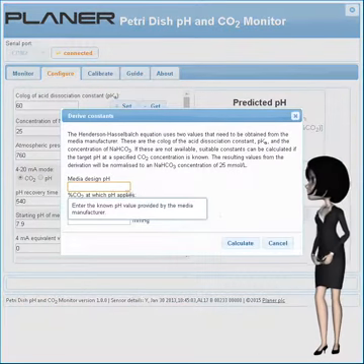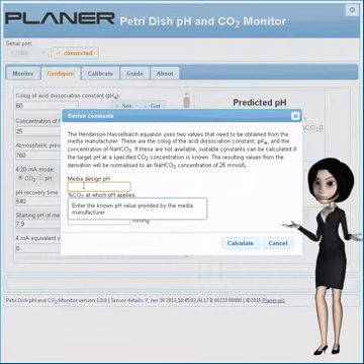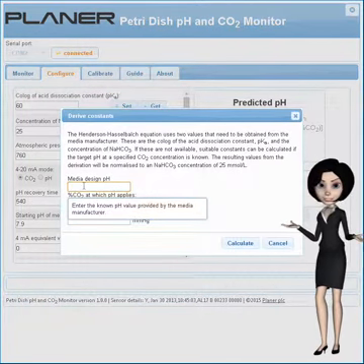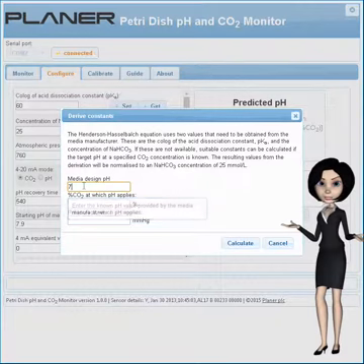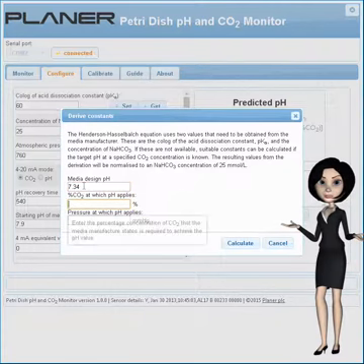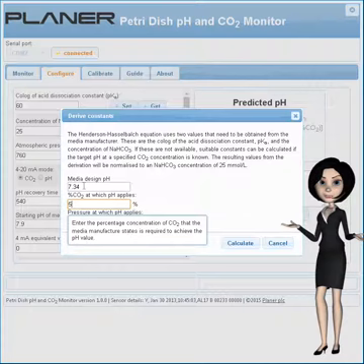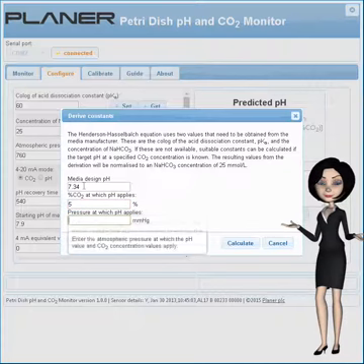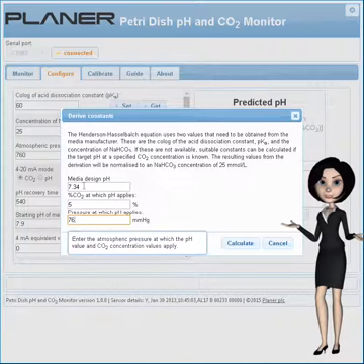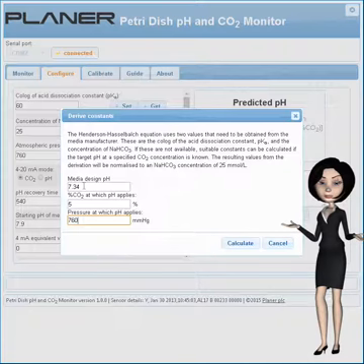Now we can simply add the target pH and associated carbon dioxide concentration. Your media manufacturer will be able to give you these. You'll also need to set the pressure at which these values apply.